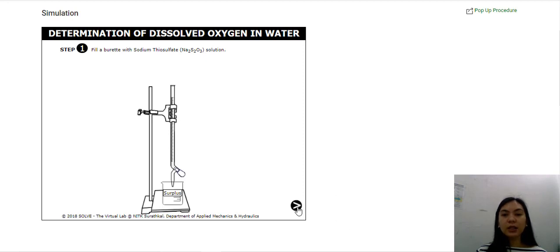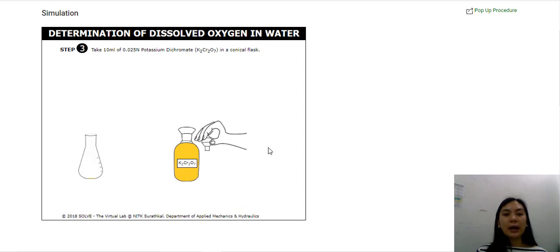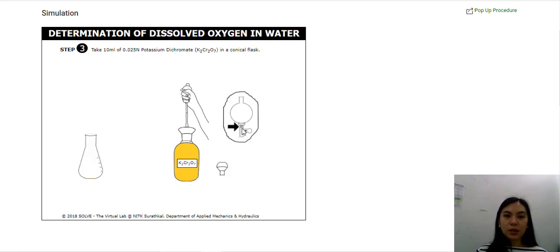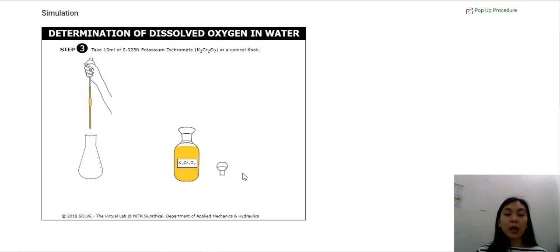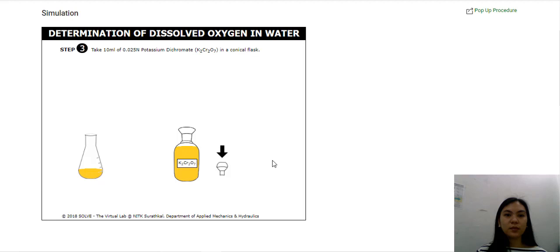Click on next. Here it says take 10 ml of your 0.025 N potassium dichromate solution in a conical flask. Remove the cap. This pipette is used to transfer a small amount of liquid from one bottle to another — click on the arrow going up to draw liquid, and click the arrow going down to pour the content into another bottle. Replace the cap of the solution and click next.